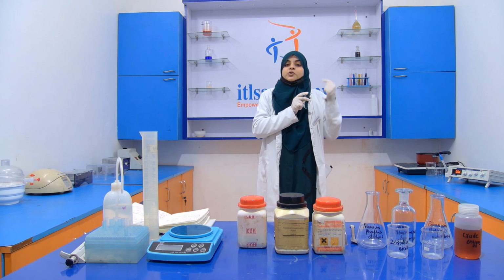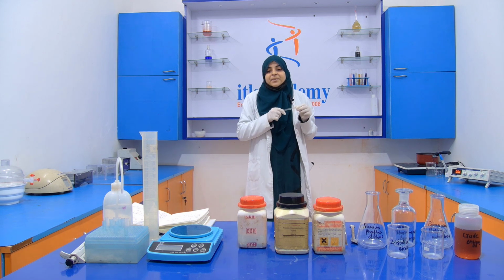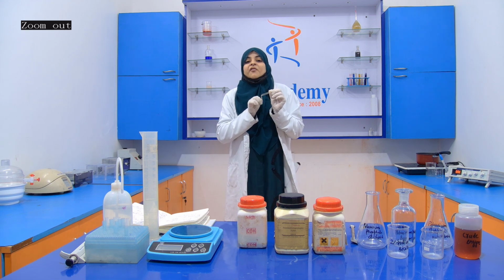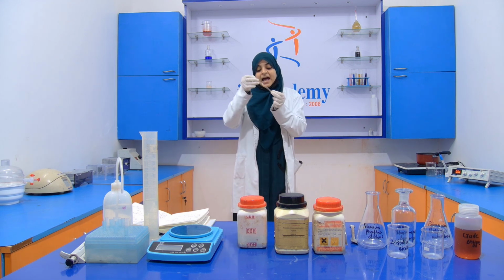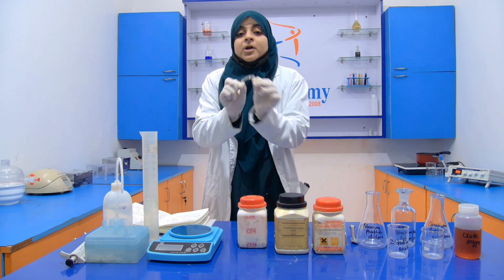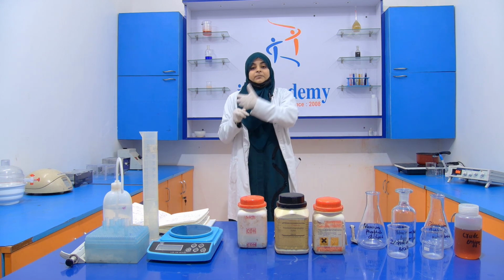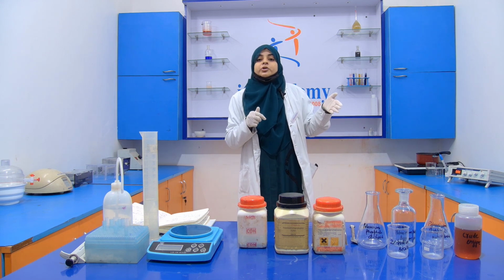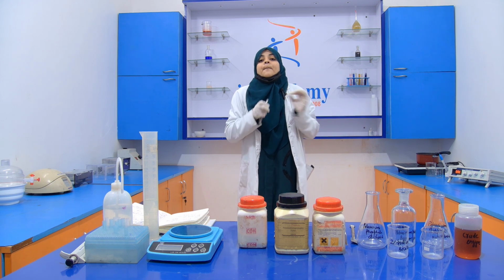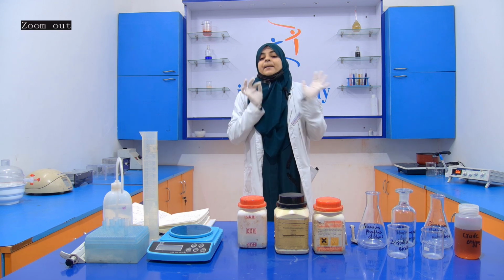The dialysis membrane is made up of cellulose acetate and has a very small pore size. Due to this small pore size, it allows only the transfer of smaller molecules from the inside towards the outside buffer. Buffer means the solution in which this dialysis membrane is kept.